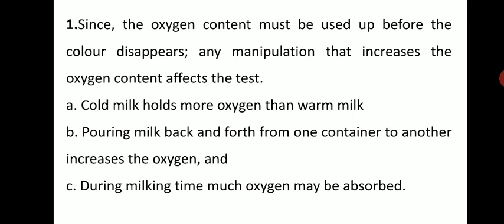Cold milk holds more oxygen than warm milk, and pouring milk back and forth from one container to another increases the oxygen. During milking, oxygen may also be absorbed. Basically this test depends upon the concentration of oxygen after adding the dye, so it should not vary due to external factors.